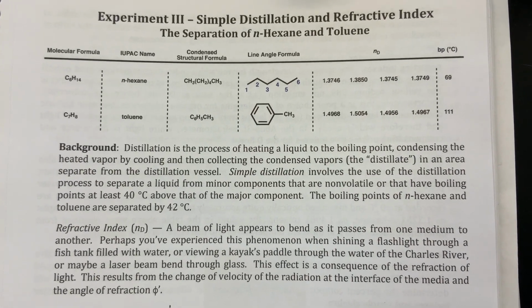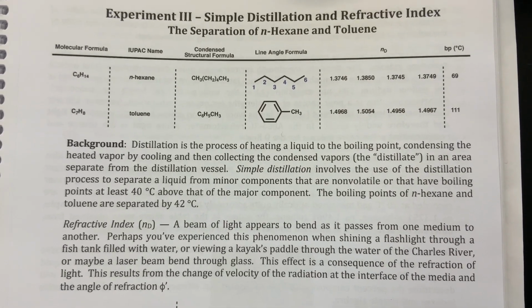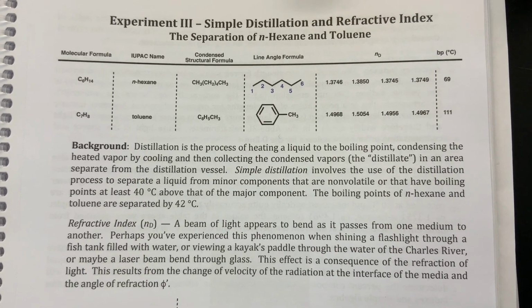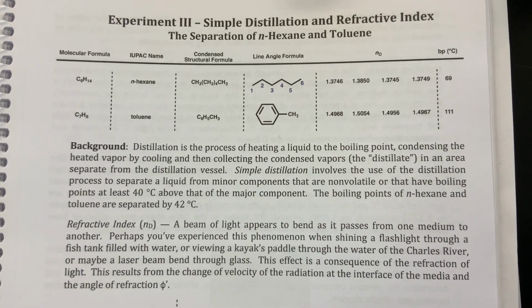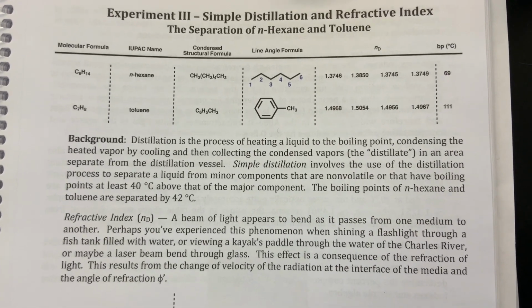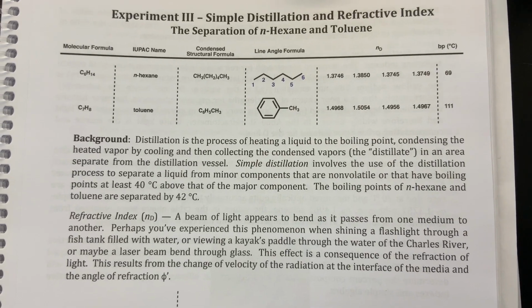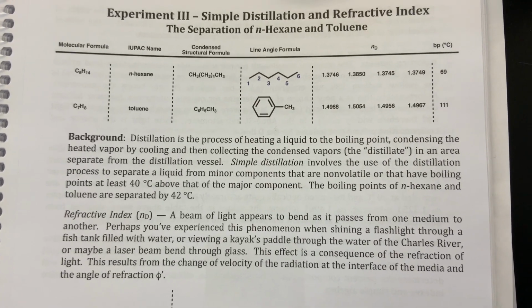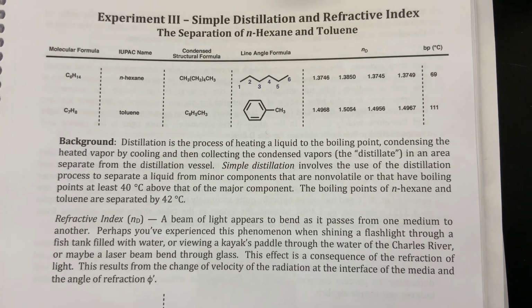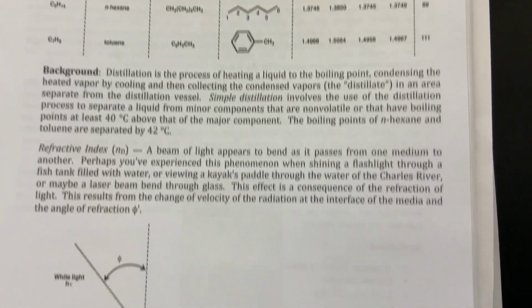We are going to perform this simple distillation at atmospheric pressure, and after we collect our 3 fractions, we will analyze the purity of each fraction using an Abbe refractometer, and with some simple arithmetic, we'll be able to tell how well we achieved separation and how pure fractions 1 and 3 are.